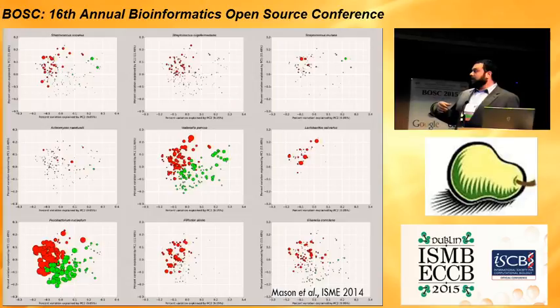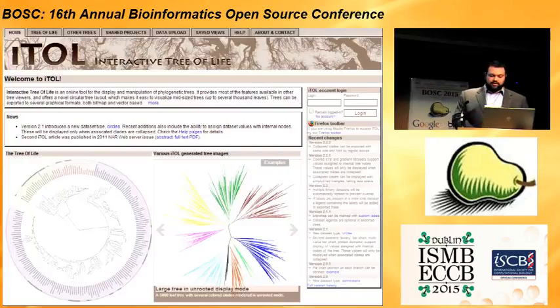We provide a bubble plot version of this. So you get one plot for each species or genus or whatever you want to specify, and it sizes the plot points in the PCoA plot by species relative abundance. We published this last year to look at specific species, pathogens versus non-pathogens in various environments, and we could see some significant differences.